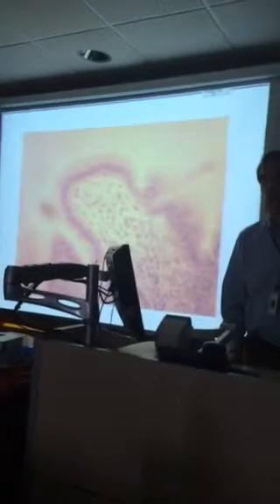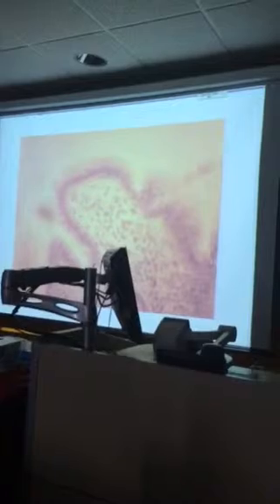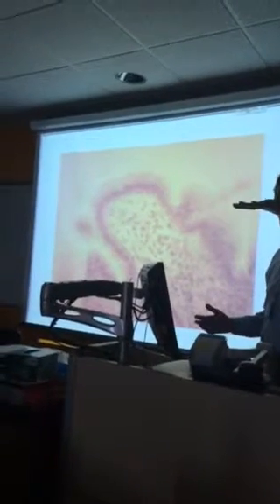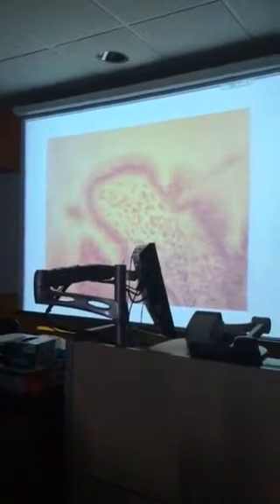Lamina propria. Might as well learn that because you're going to see it again in tubes of the urinary tract and also the reproductive tract. Lamina propria. Okay. The epithelium may change in a mucous membrane, but that loose connective tissue deep to it is seen throughout. Lamina propria. That's what that is. Okay.